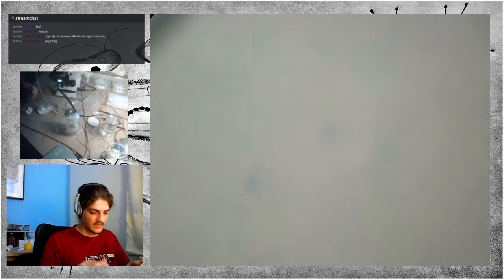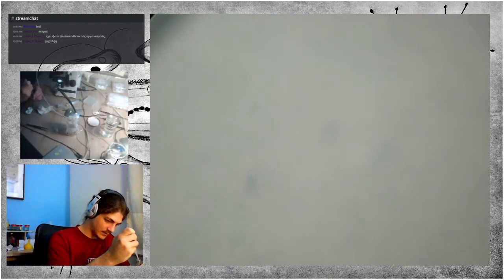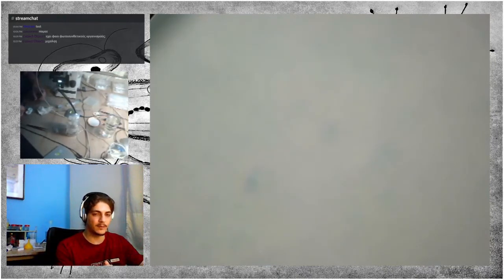There we go. Now let me put a little bit of water for the cover slip to rest on. You don't need a large amount, the slide has to be very thin, because otherwise you cannot use the full capacity of the higher magnifications, and also specimens like fast moving ciliates or microorganisms generally can move around and get out of focus very easily.